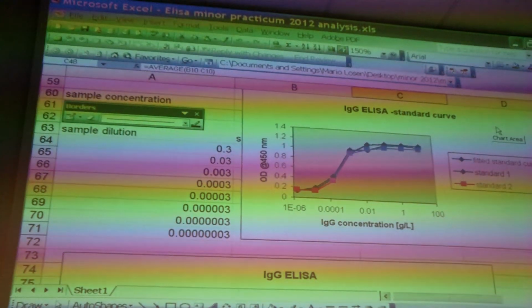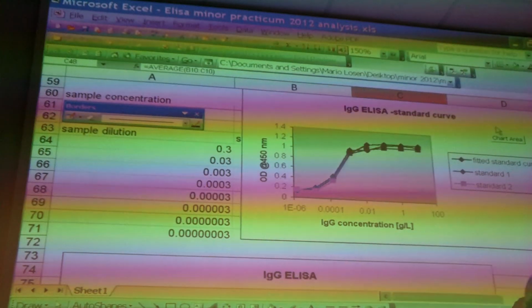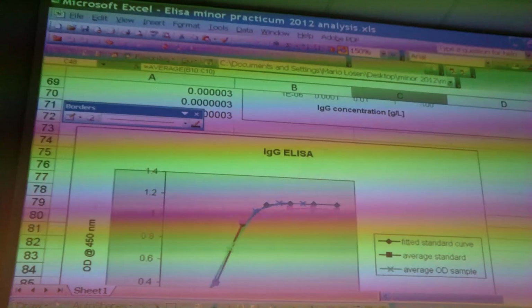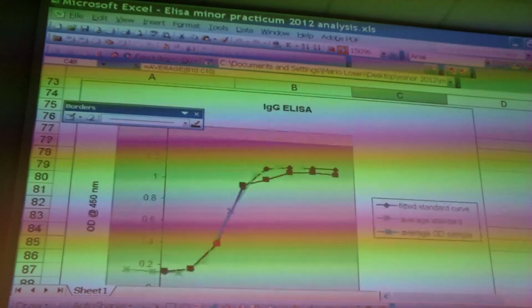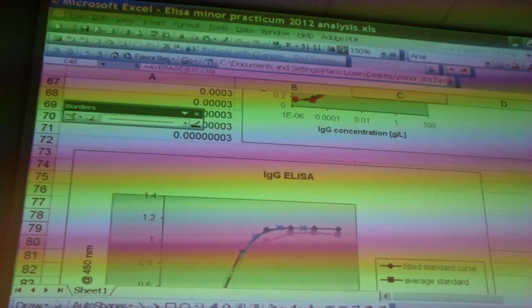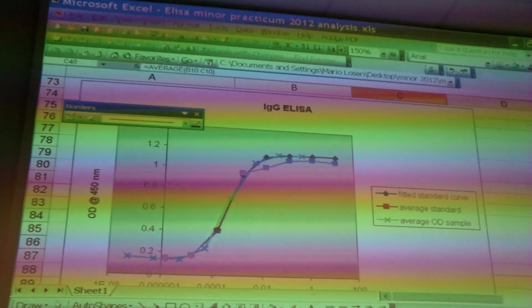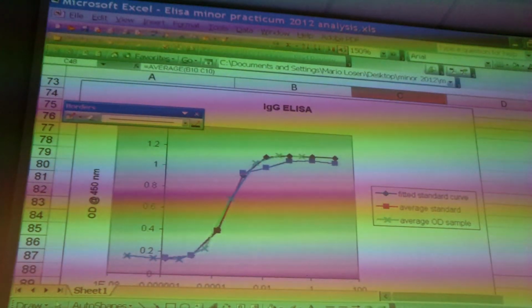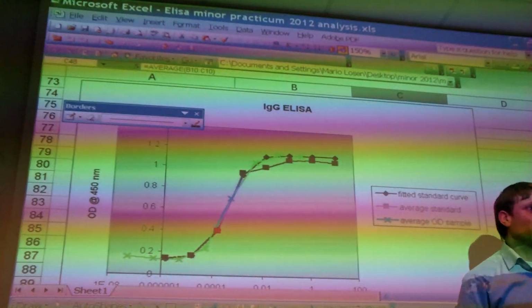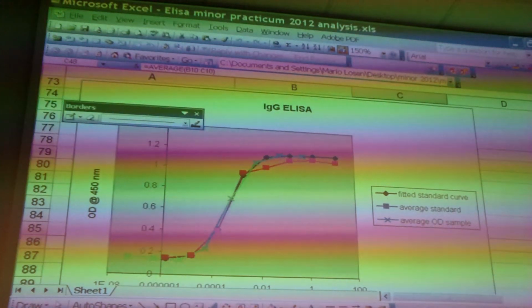That's the trick. You dilute it, for example, not at all, maybe this level. And what you're going to get then is a second curve. It's not in here, because I already fitted it. You get a second curve, with unknown concentration of your sample. In this case, we also did a lot of different dilutions. We just started at a high level.